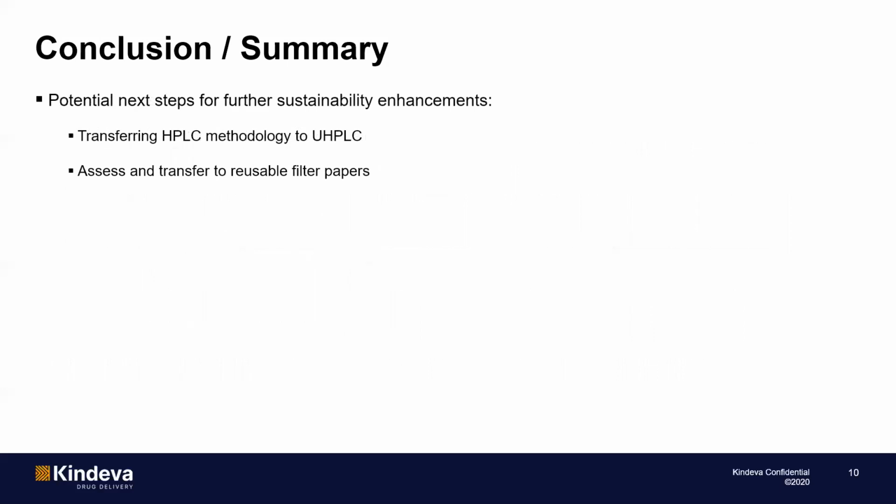Potential further steps that could again increase the sustainability would be to transfer HPLC methodology to UHPLC, and to assess and transfer to reusable filter papers.